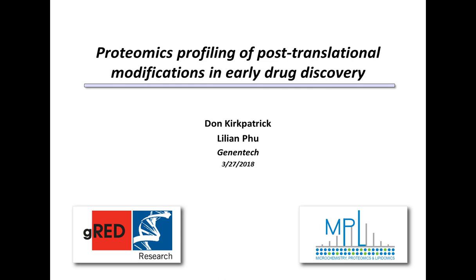Yeah, so that's another good question that comes up quite a bit. Within our group, we're actually running some in-house software that basically ties together a series of modules to perform the various steps in the data analysis process. With respect to the label-free quantitation, we're taking advantage of a piece of software called VistaQuant or CrossQuant that was originally published by Corey Bakalarski and Steve Gygi in a JPR paper about 10 years ago, and it's been updated to be able to handle the match-between-runs features that some of the more recent software tools such as MaxQuant do quite well.